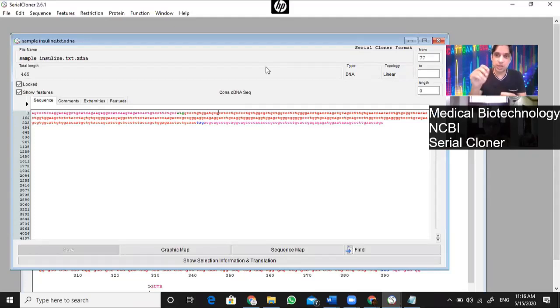You can actually see those things with your own eyes: what will happen if I add a base pair, what will happen if I add 2 base pairs, what will happen if I delete 3 base pairs or add 3 base pairs or 5 base pairs. So you can actually see the difference after the mutation. So let's quickly try to add a mutation somewhere in that sequence. How about that place? Any place we can choose, it's our choice.